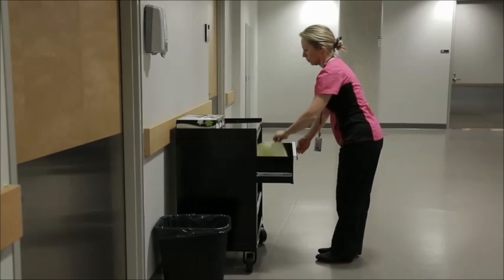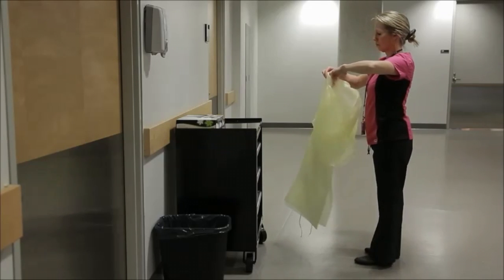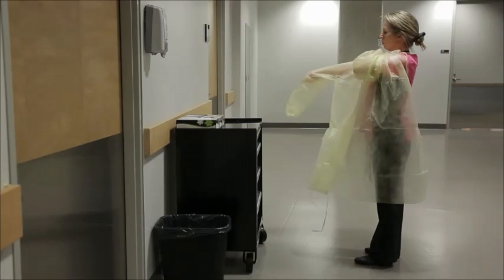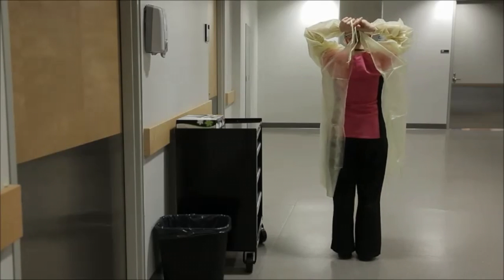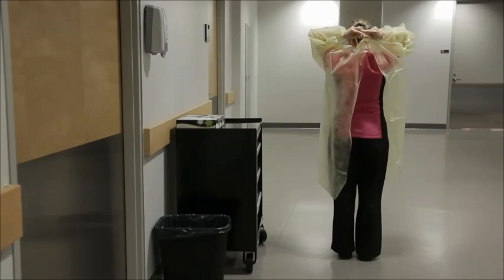Wear a gown that fits well in size and length. Hold the gown so that the opening faces you. One arm at a time, put on the gown so the opening is at the back. Pull the gown up over the shoulders, then tie the neck and waist strings so that the gown overlaps.